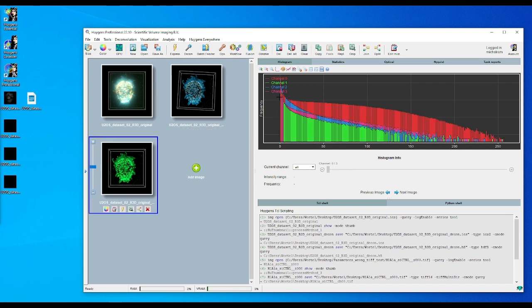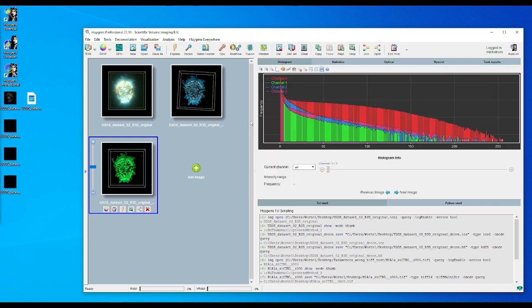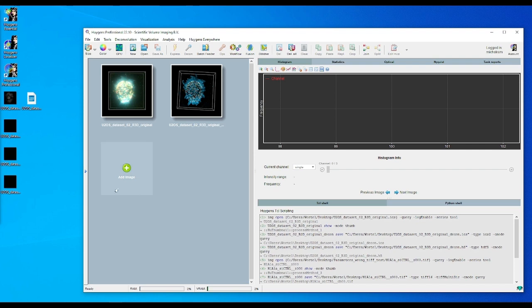So then it would have only had 50 intensity values compared to the 255 it has now. So by looking back at the scaling factors, we know what the maximum intensity values of these channels originally should have been, and we can work it back and get it into our image. But we'd first have to convert it to a data type which allows for more intensity values than 255. So let's remove this image.